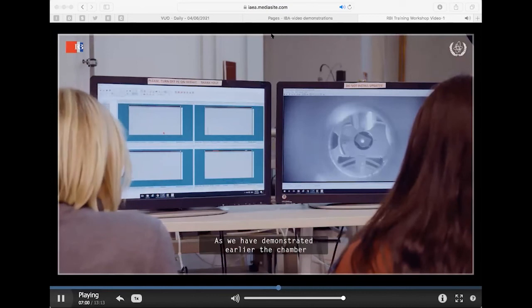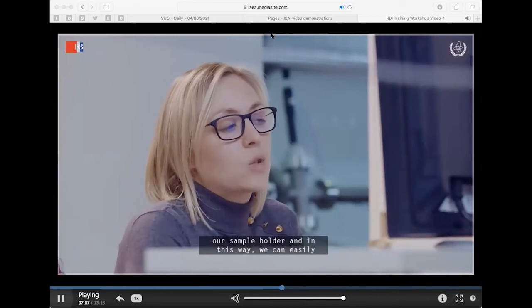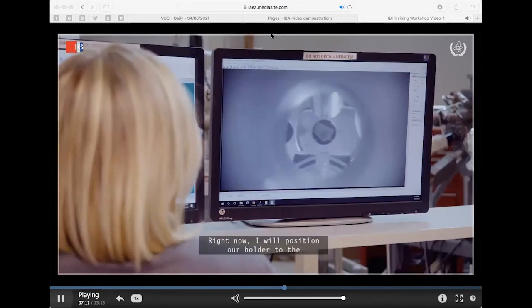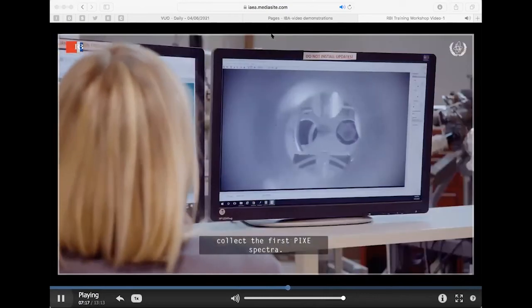because we are using certified reference materials that are very sensitive and can be destroyed with high density currents. As we have demonstrated earlier, the chamber is equipped with motors that are connected to our sample holder, and in this way we can easily manipulate the samples within the chamber. Right now, I will reposition our holder to a calibration standard for which we will collect the first PIXE spectra.